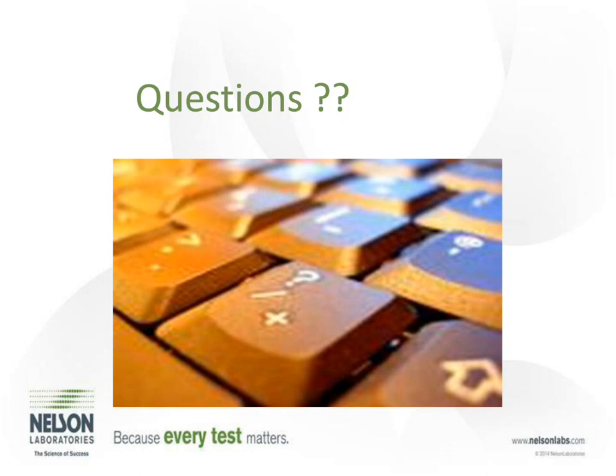Okay, fantastic. Thanks, Thor. Our next question is, in approving a medical device, should all three, cytotoxicity, sensitization, and irritation tests be conducted, or is one sufficient? What are the conditions? That's another common question we get.